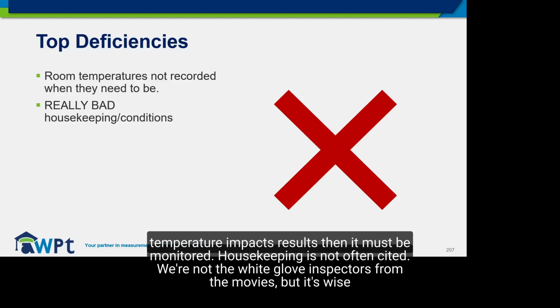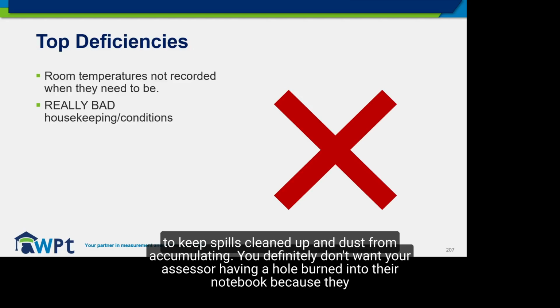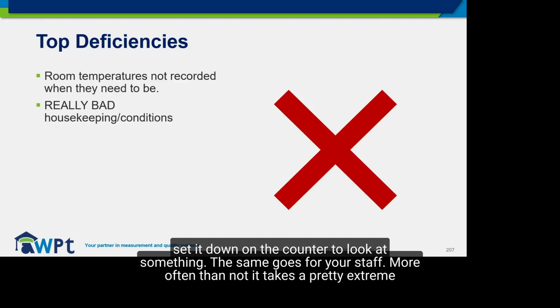Housekeeping is not often cited. We're not the white glove inspectors from the movies, but it's wise to keep spills cleaned up and the dust from accumulating. You definitely don't want your assessor having a hole burned into their notebook because they set it down on the counter to look at something. The same goes for your staff.